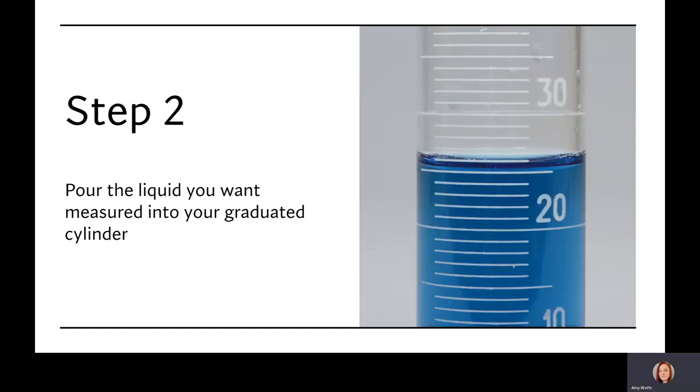The second step is to steady the tube with one hand while pouring the liquid you are measuring with the other hand. You want to do this slowly to avoid any spills or messes.